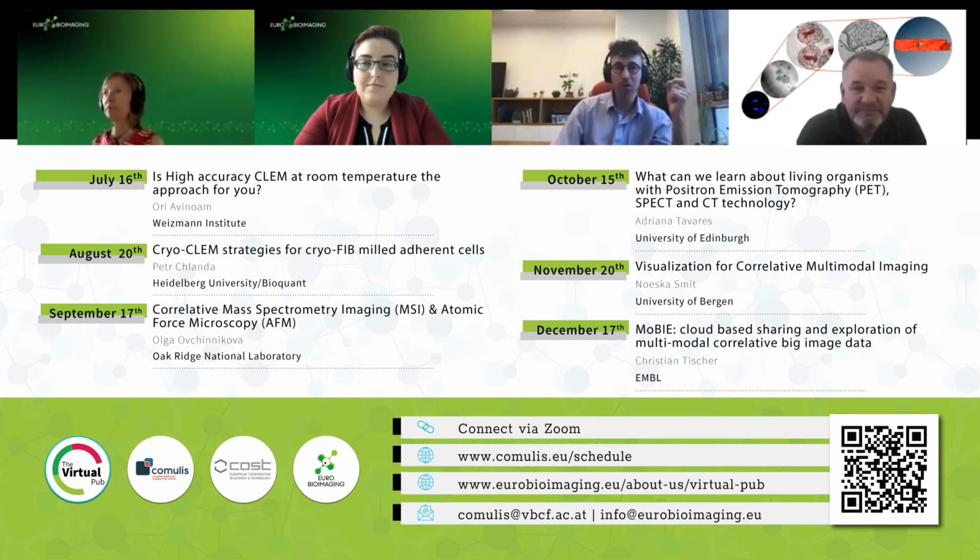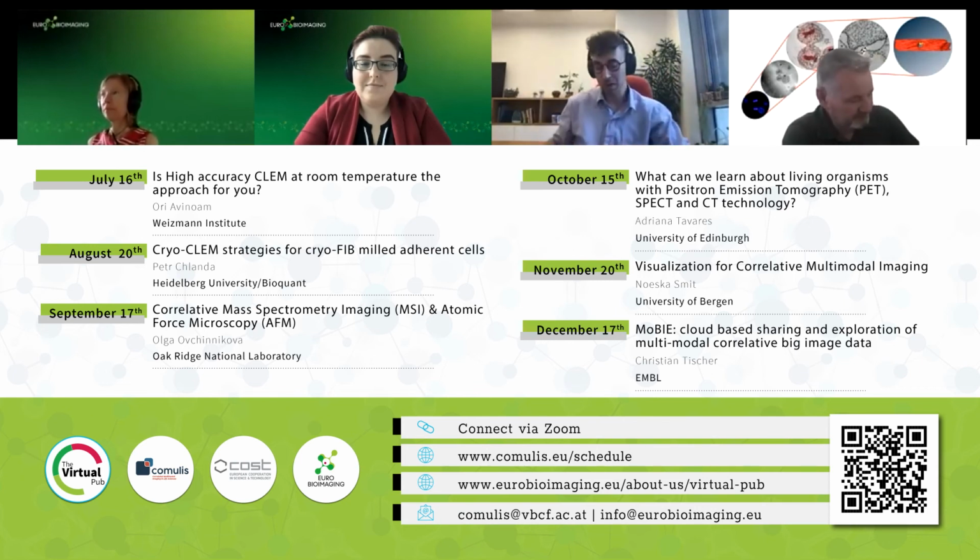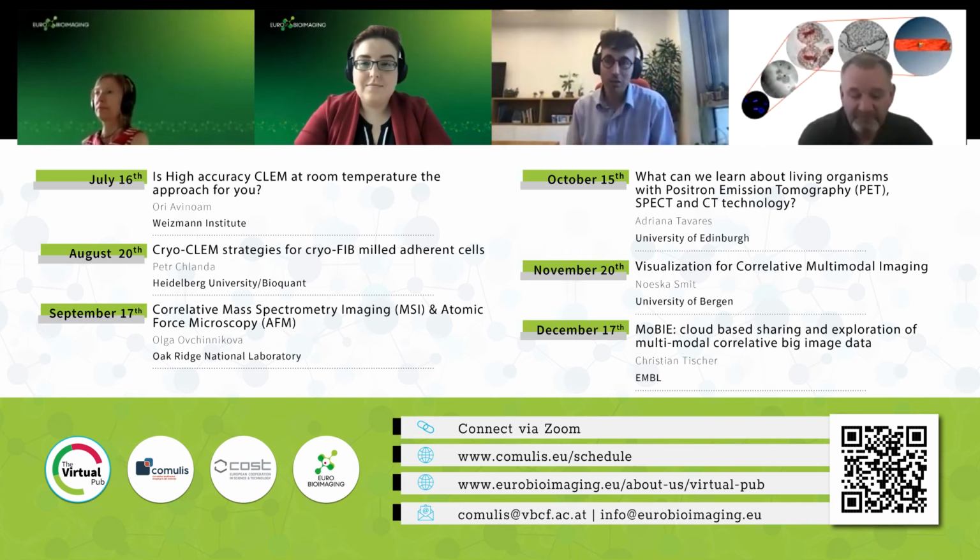I mean, you do not want to make all this effort to find out that actually... and occasionally we do. Occasionally we look at things that people have characterized and discussed for years. And then when we look under the hood, under the fluorescent signal, we realize it's either not what people believed it to be, or actually it introduces a phenotype compared to the unlabeled sample. So this is something that I would say is actually good, serves science.